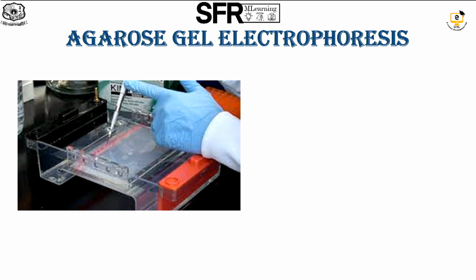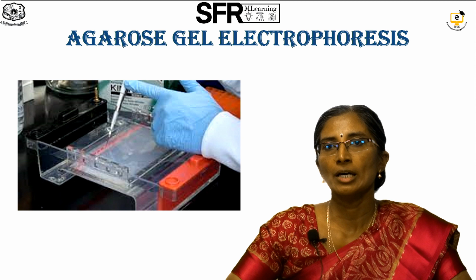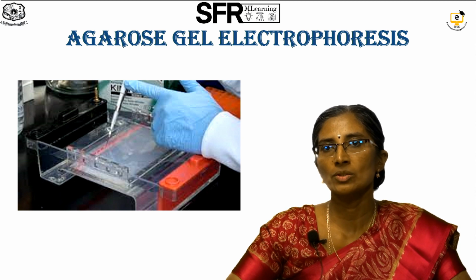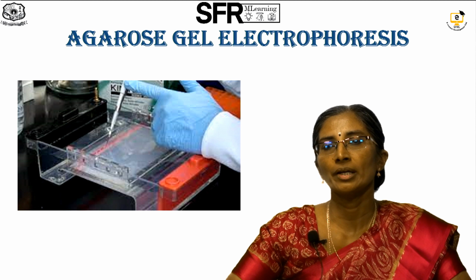So this is the apparatus that is used for DNA observation or analysis. Here I have shown the diagram where the tank will be filled with a buffer. The boat will be casted with agarose. The agarose will be 0.8% to 1%, and the comb is used for casting the well. And the sample that is dissolved in TE buffer has to be prepared, mixed with the sample loading dye and added to the well.